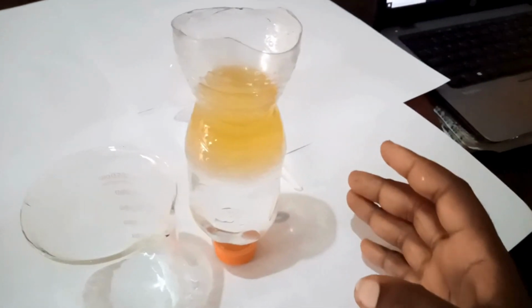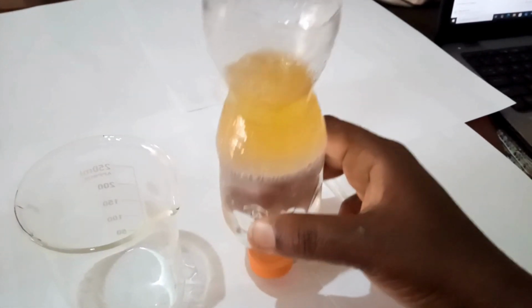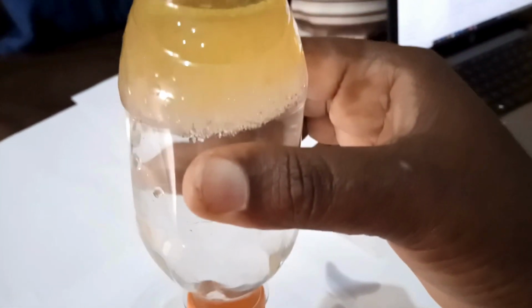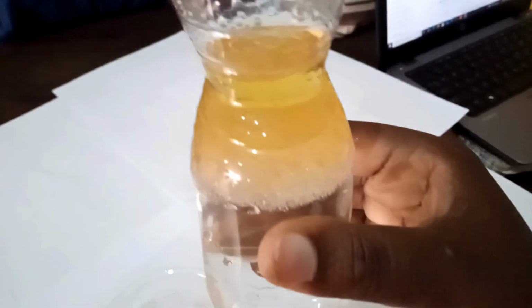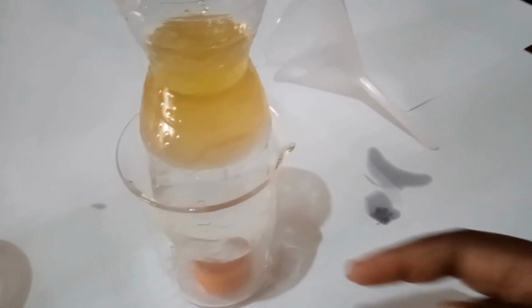Okay, in this clip, I'm still showing you that you can use a plastic bottle to separate immiscible liquid mixtures. You can see when we pour our mixture in the bottle, the cooking oil still goes up and the water goes down. On the orange lid, you can put some small holes and probably seal it with some sellotape. And when you are going to separate, you can remove the sellotape and the water pours into the beaker or any other container. Once it's done, you cover the holes and you will have separated the two liquids.